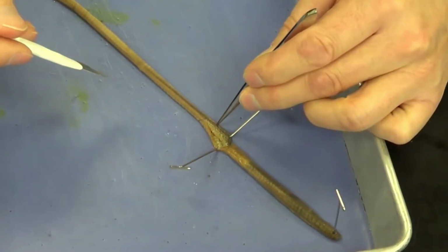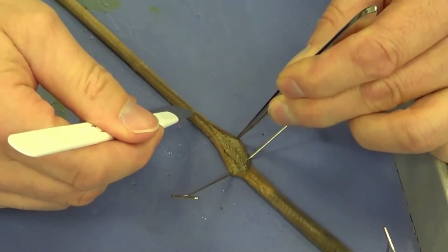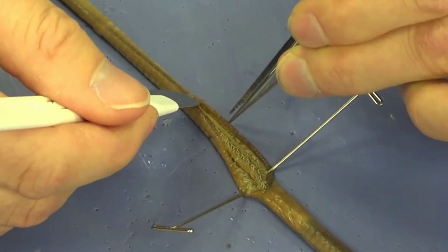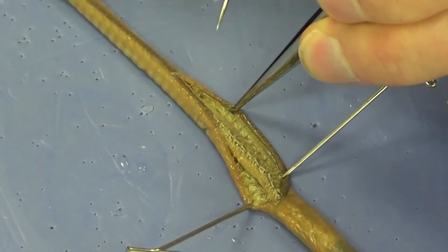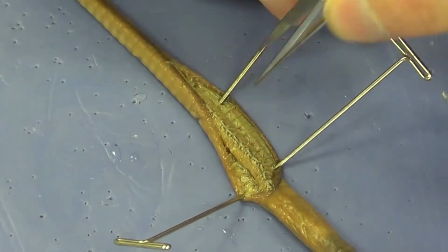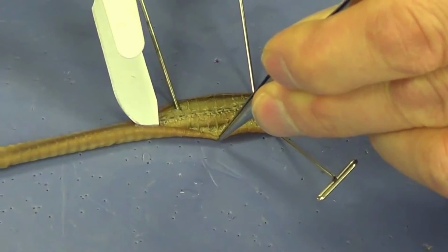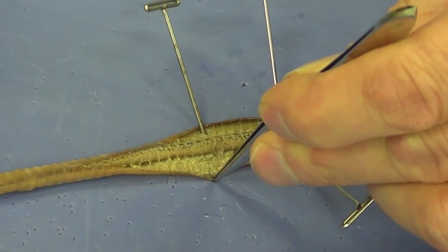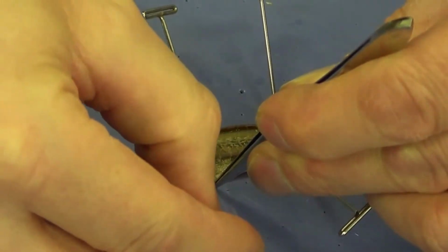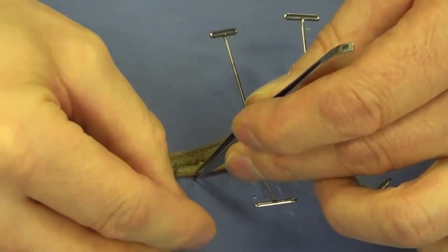Now I'm going to take the remaining skin and I'm going to pull it away just a little bit, and again I'm going to continue to cut very gently, maybe a 1/2 inch to 1 inch at a time. And I pull back the skin, or reflect the skin as we say in biology, and I put another pin in at about 30 degrees. And I just continue to work my way down towards the anus. So again, I'm going to go ahead and do the other side, working about a 1/2 inch to 1 inch at a time. And I'm going to go ahead and pin this side.